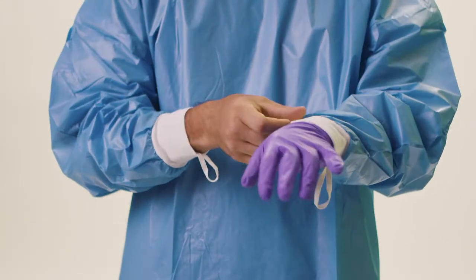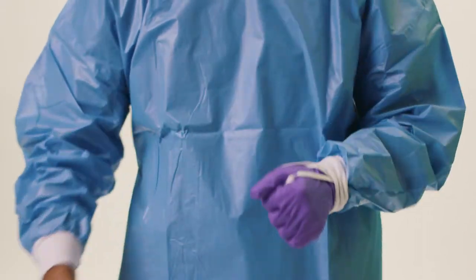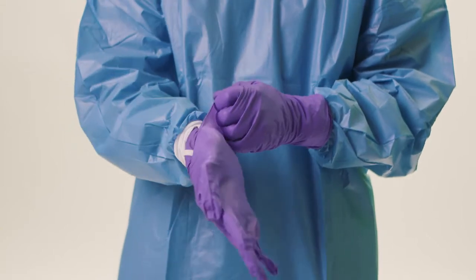Put on the first pair of gloves. Make sure to place the thumb loops over your gloved thumbs. Put on the second pair. Be certain that it covers the gown's knit cuffs.